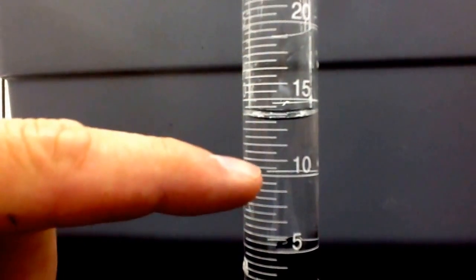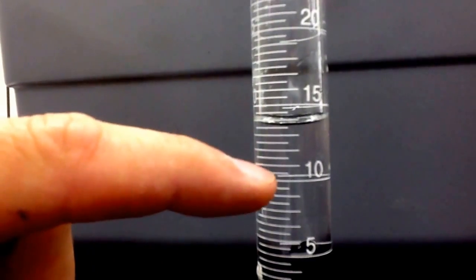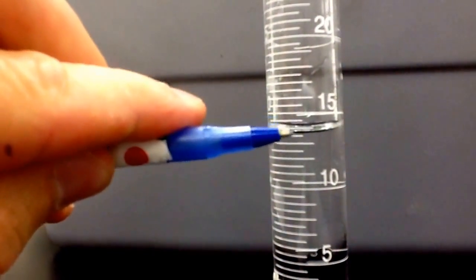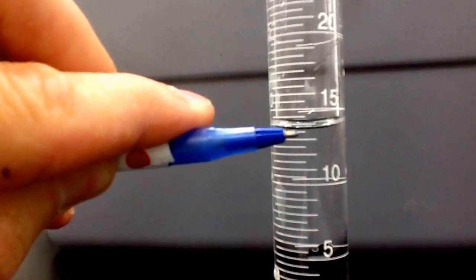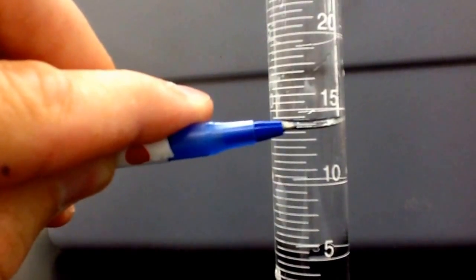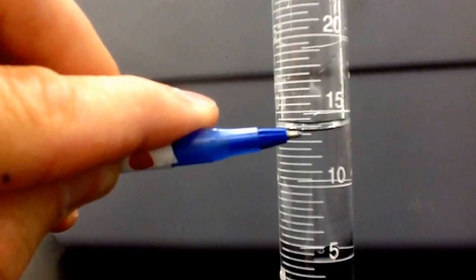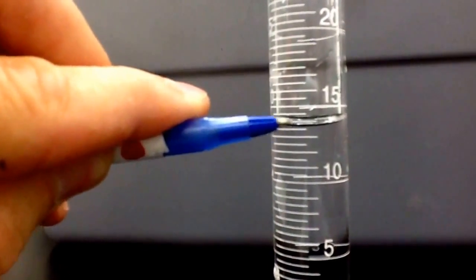This says it is — here's the ten spot, here's the fifteen, and so each one of these would be eleven, twelve, thirteen, fourteen up to fifteen. Each of these go by half, so this would be ten and a half, then eleven. We can see it's between thirteen and fourteen at the bottom of the meniscus. There's thirteen and a half, and really the last number we can estimate — it's got to be somewhere between thirteen point five and fourteen. Halfway between would be thirteen point seven five, so I'm going to call this thirteen point seven milliliters, reading from the bottom of the meniscus.